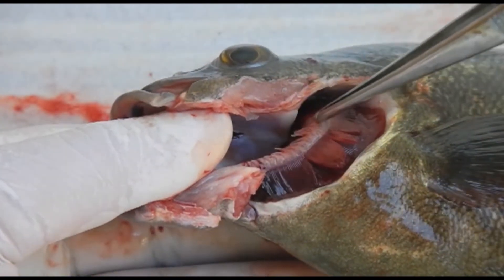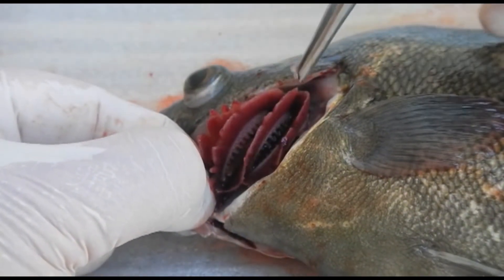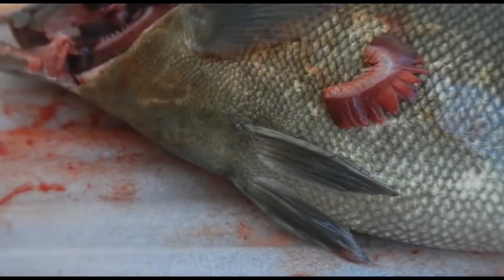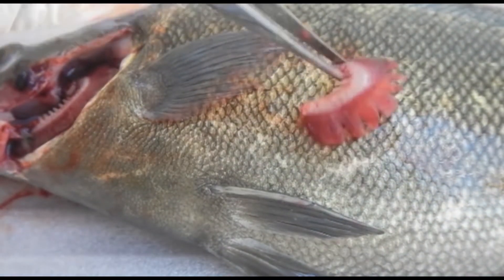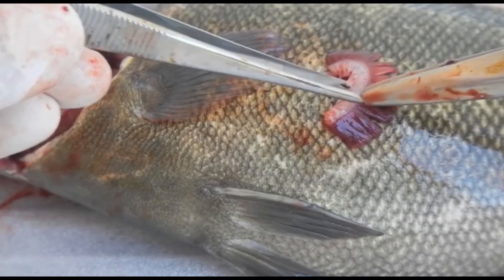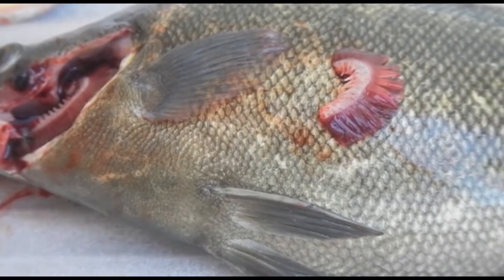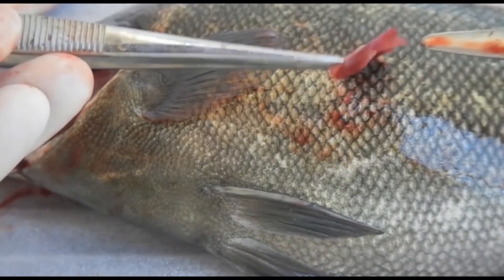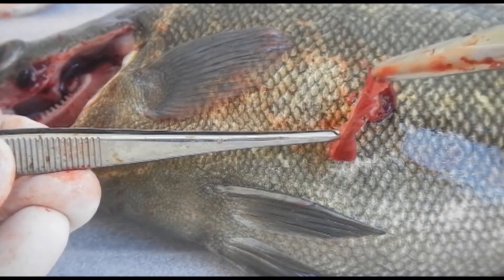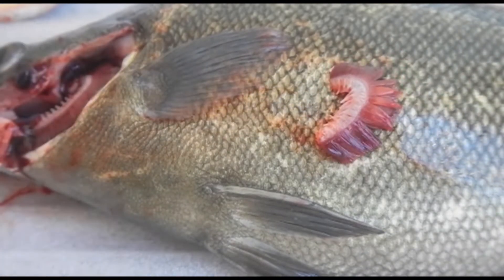In close-up view, you can see gill rakers on the anterior portion of the gill arches. Most fish have four gill arches on each side. Now we take off one of the gill arches to see the anatomy. We've got this cartilaginous semi-circular part — the gill arch — and these are the rakers that help filter food from debris. Coming out of the gill arch are primary filaments, and you'll notice there are two sets of filaments. The fish is able to hold these apart or together depending on how much of the gill it needs to recruit for respiration. Each of these primary filaments will also have secondary lamellae.